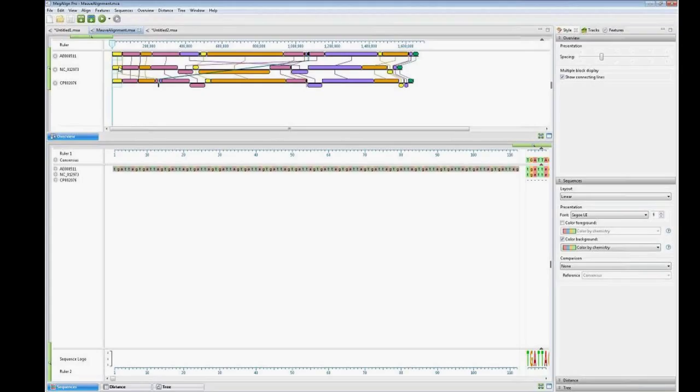And so you'll notice the sequencing blocks are displayed a little bit differently in this case. They're color-coded by segment, and they're also connected by lines. So you can see, for example, this pink segment is the same in all 3 genomes, and it aligns pretty closely along the genome. But you'll notice in other cases, you have these lines crossing, and that indicates some genome rearrangement.